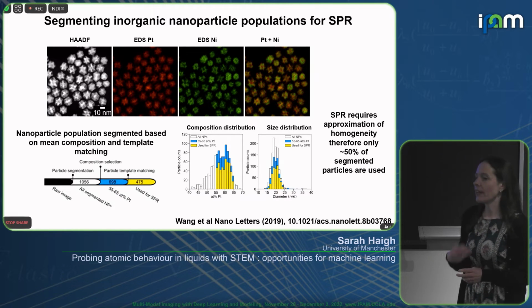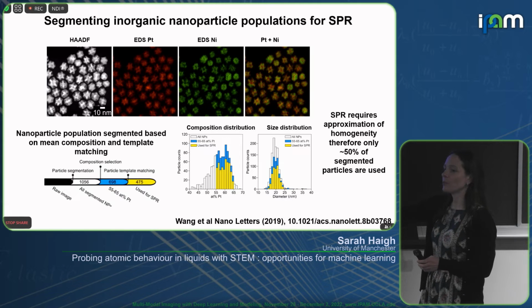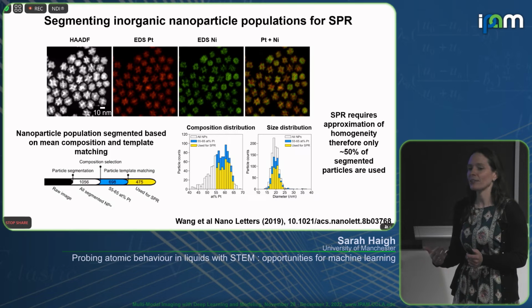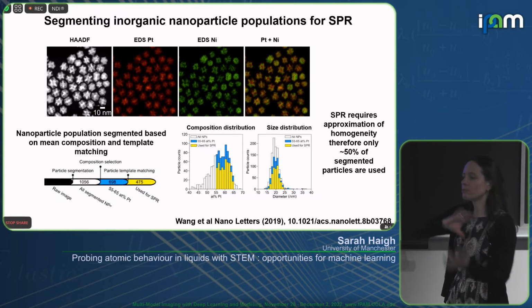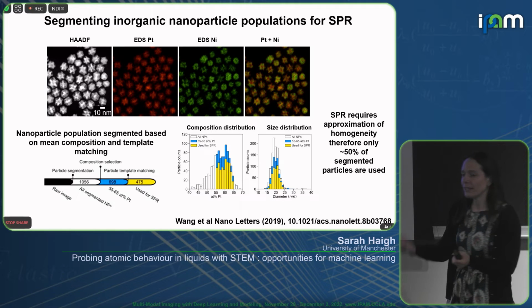Okay, so we first came to trying to do single particle reconstruction when we wanted to start including elemental analysis in our conventional tomography. And you're going to hear later, but in conventional tomography, you take your sample and you don't let the liquid rotate it, you manually use the holder in the TEM, you tilt it at different angles. This is in some ways easier because you've got a better understanding of what your tilt angle difference might be from one image to the next. If you've got a particle randomly rotating in the liquid, it could randomly rotate in all different directions. It certainly doesn't choose to go the same way each time.